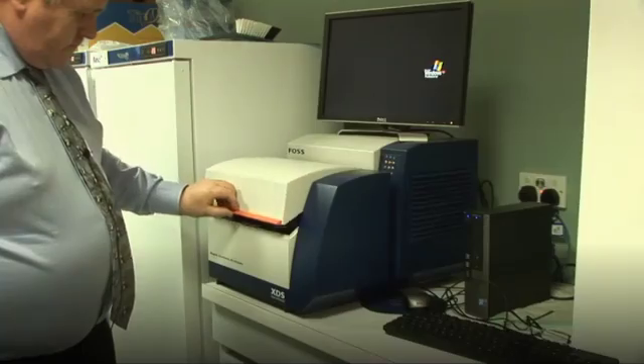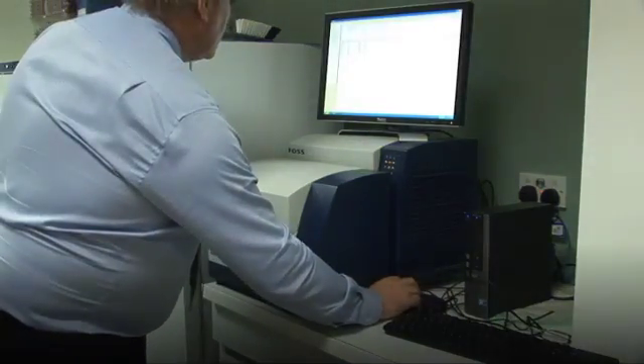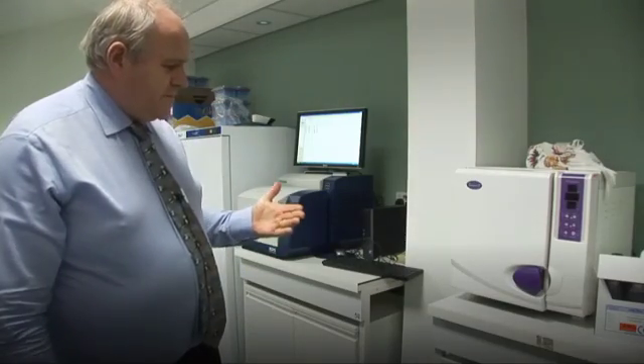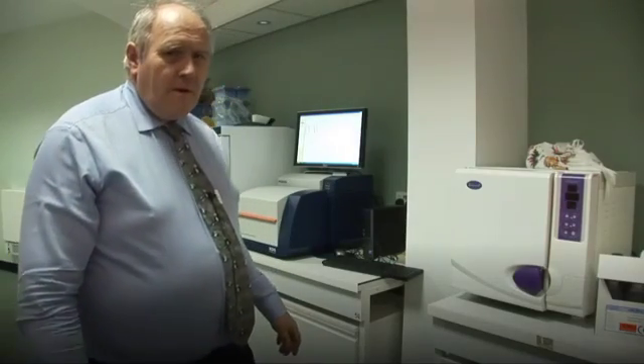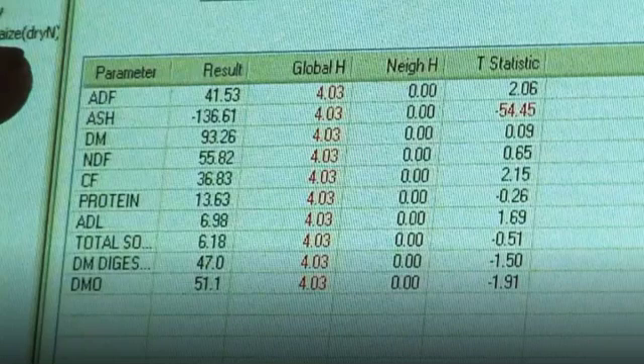That takes about 32 to 50 seconds to do, and then when we have finished the machine will display a profile of the various components. We can analyse it for protein, for minerals, for fat, for various fibres, parts of the cell wall, the cellulose, and also the soluble sugars.